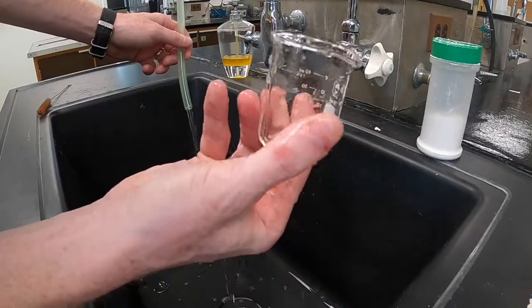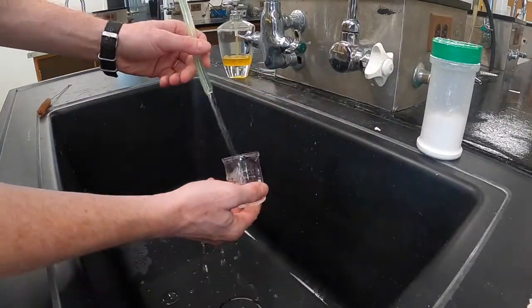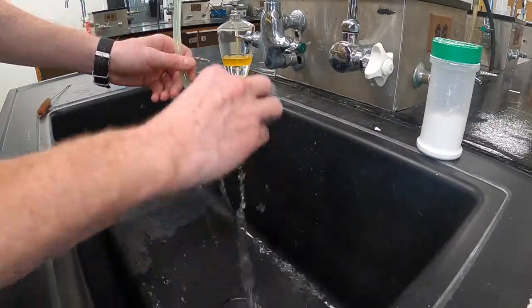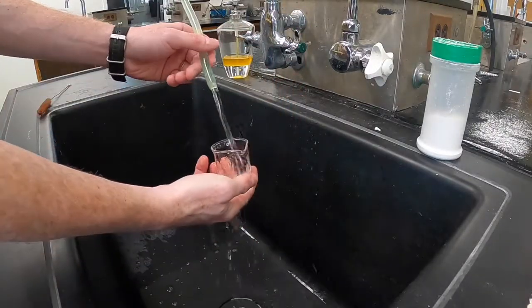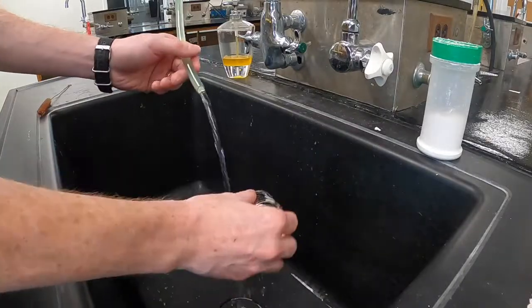Once you've removed the soap residue, you can start the rinsing steps. The first rinsing step is to rinse with several large portions of tap water, and this should remove most of the residue of the soap and any remaining particulate.